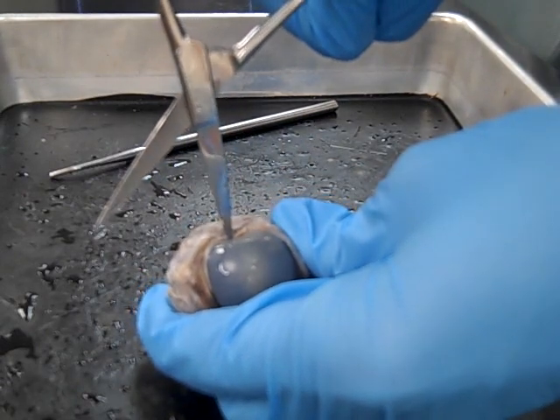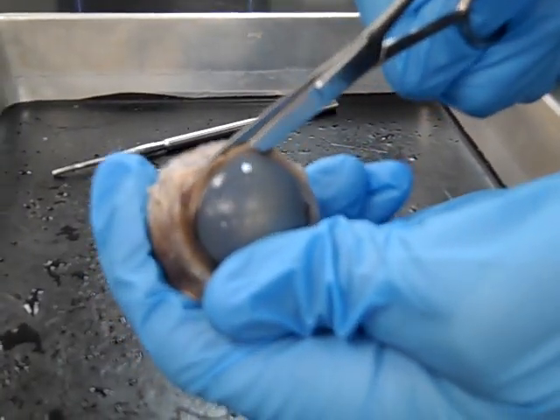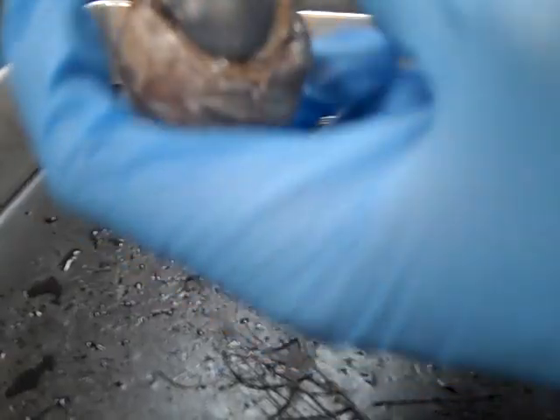Do this very carefully. Be careful not to stab yourself or anyone around you. Safely puncture the eyeball and complete the incision around the cornea.